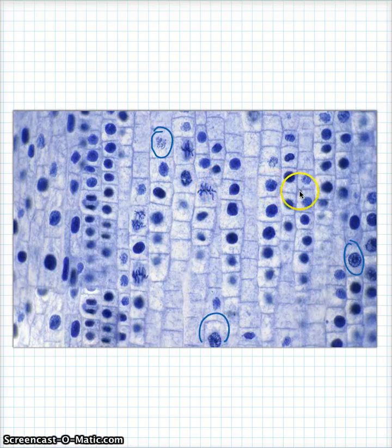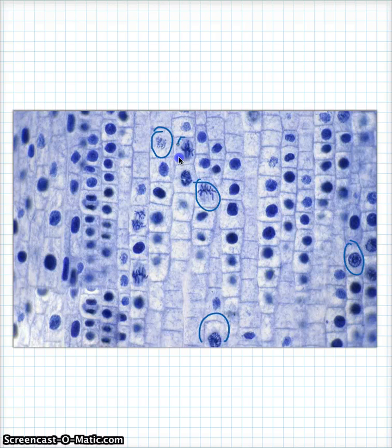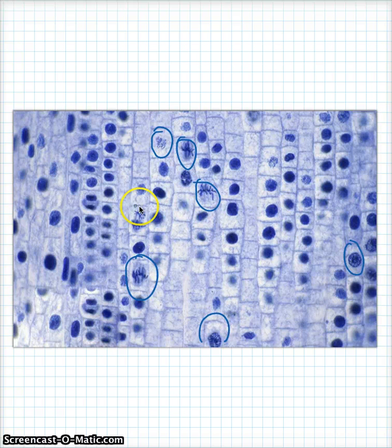All right, find a metaphase. There's two of them. Maybe three. Probably three. One here. One here. One here. And I'm in a hurry. I'm trying to be quick, so maybe I missed one. Here's a great anaphase.